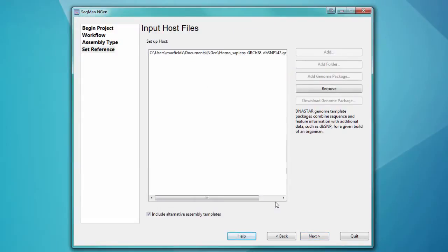During assembly, SeqMan Engine will remove host DNA first, then assemble the remaining data.